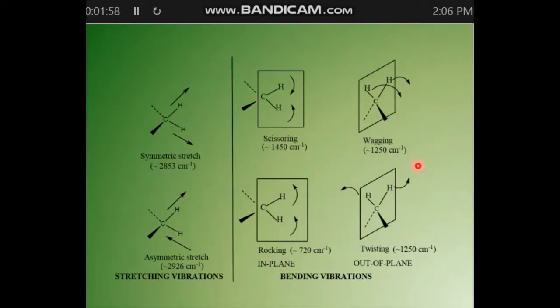So what we need to understand is that the vibrational band of any functional group appears at a characteristic wave number. The entire IR spectrum may be used as a unique fingerprint of a compound. Each functional group has a unique fingerprint region.